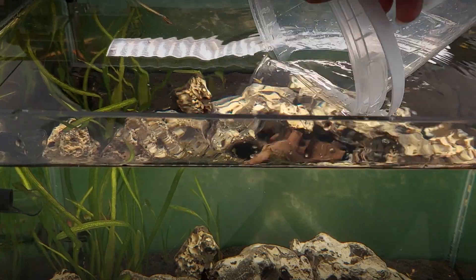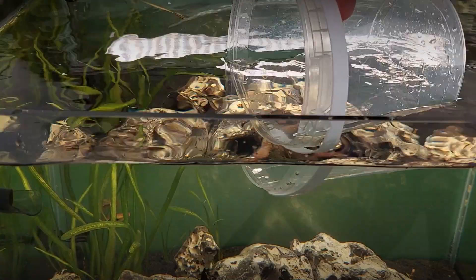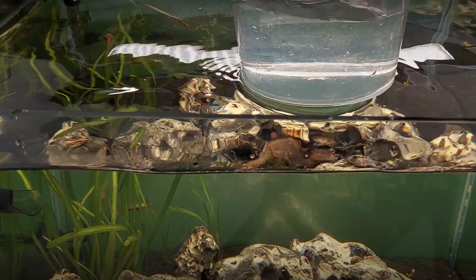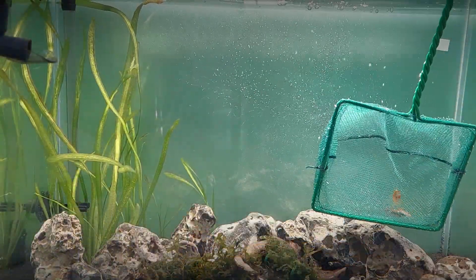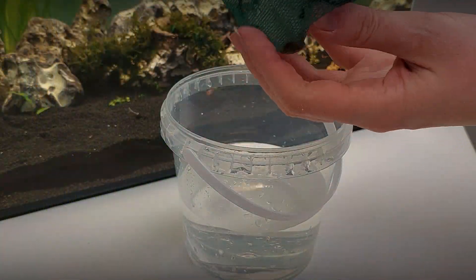Rinse the container with aquarium water and fill it with enough water to cover the fish. Catch the fish with the net and place it inside the container.